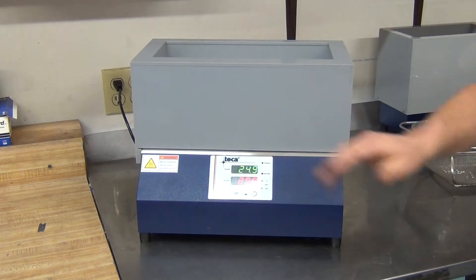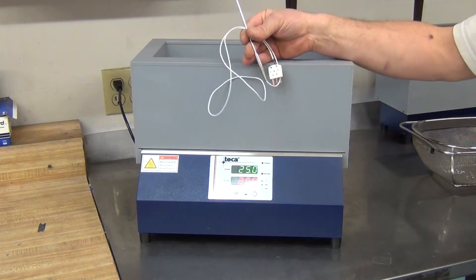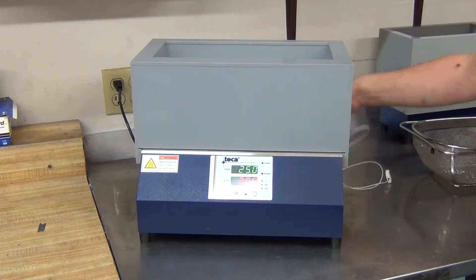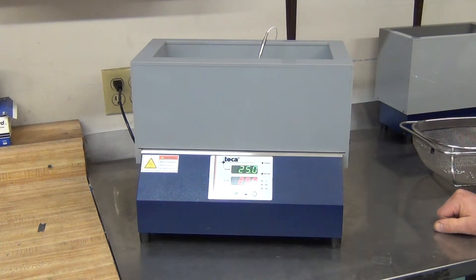You can rely on either the built-in temperature control or a built-in sensor that's in the plate itself. Or it comes with a remote temperature probe. You plug that into the back, insert it into your beads, and now you're controlling right at the bead temperature.